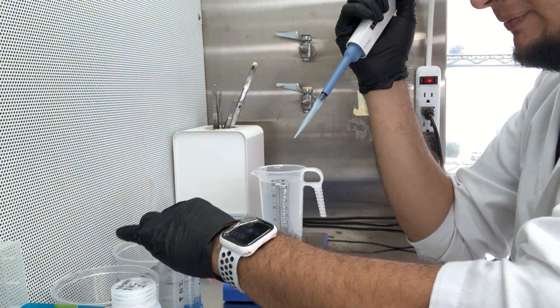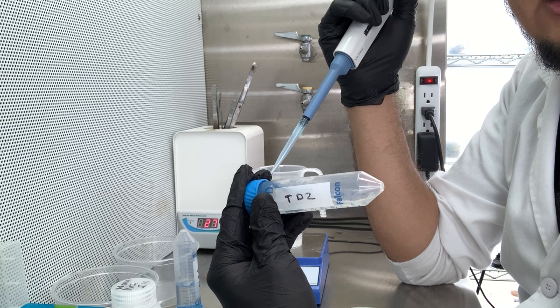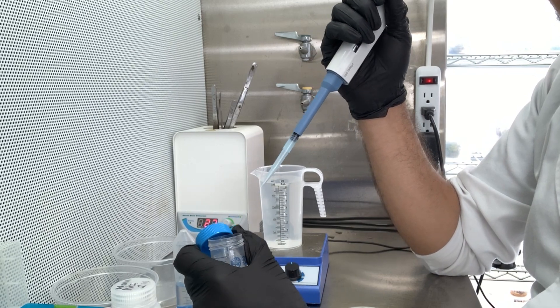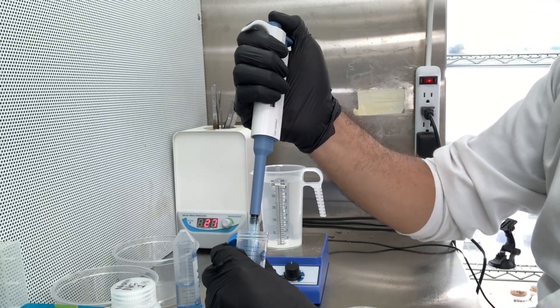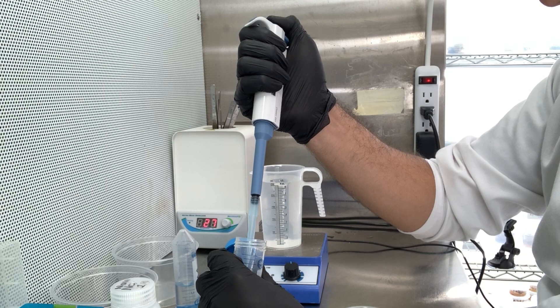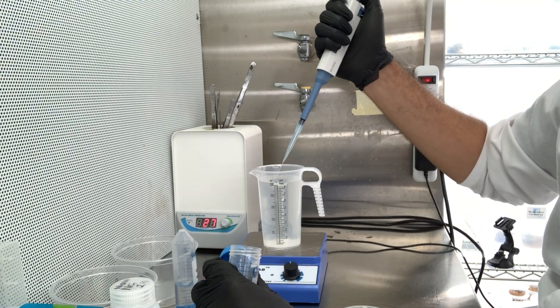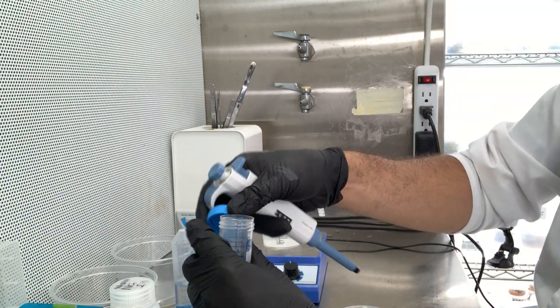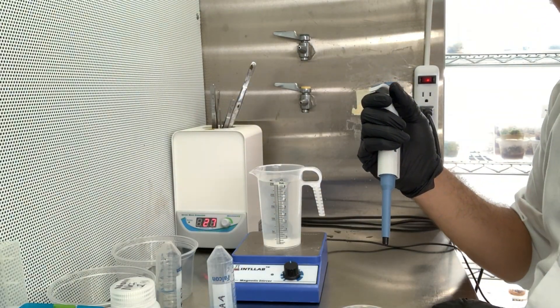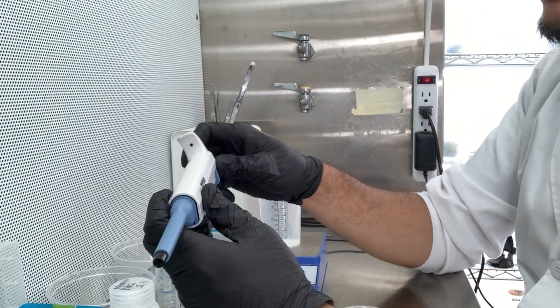This time I'm doing something different — I'm not using BA, I'm using TDZ to see if it works better. TDZ is stronger than BA. I want to do 3 mL per liter, so that's one, two, and three. Trash the tip.